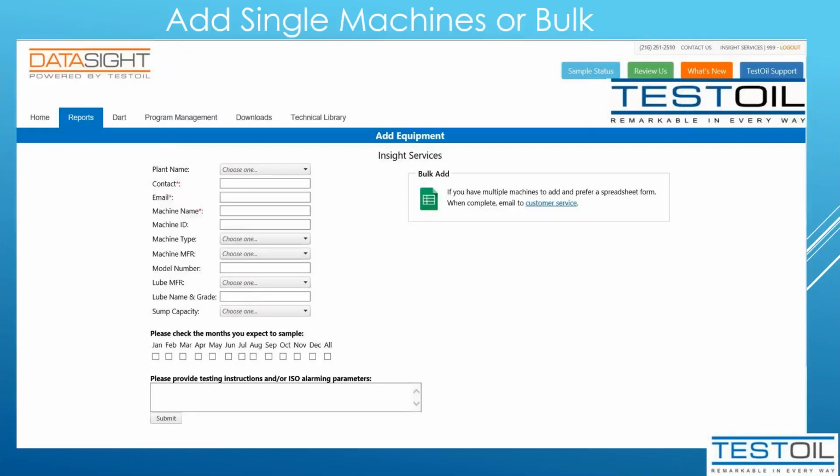So here you can add just a couple pieces of equipment, or you can do a bulk add by using our attached spreadsheet. But if you're going to add equipment, I highly recommend filling in as much information as possible, even though only these areas with the red asterisks are required.